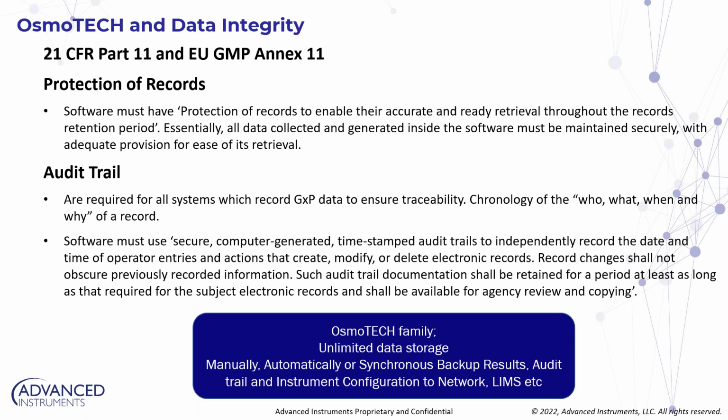Now, what is audit trail? Audit trail is the full traceability. This is the full, complete story on the device's utilization. So who, what, when, where. In the case of our devices, we even have why built in. So there's complete information on anything happening on the device. Let me give you an example.